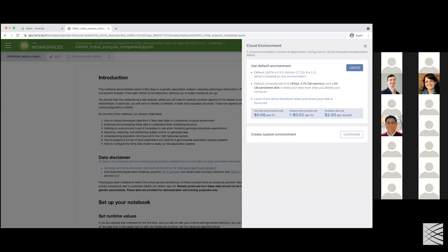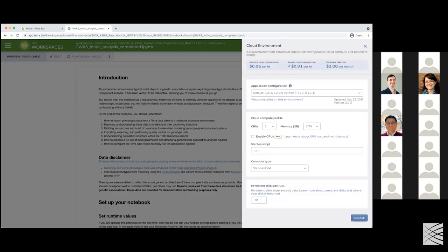You would want to double check the dashboard to make sure that it doesn't have some specific instructions. And we're going to see that in a few minutes with another workspace that we'll take a look at. But for today's purposes, it doesn't matter too much. We can just use the default environment. Now, if you wanted to change it, you click on this Customize button. Actually, I'm even jumping the gun a little bit. Let me come back to that.